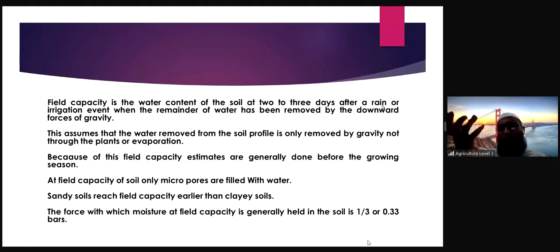Water will evaporate, then it will be restricted by the polythene sheet, cool down, and come back to the soil again. So evaporation is protected, and transpiration will also be protected as a polythene sheet is there. So we will be only allowing downward movement of water. Water will go down, and that downward movement is due to the force of gravity.